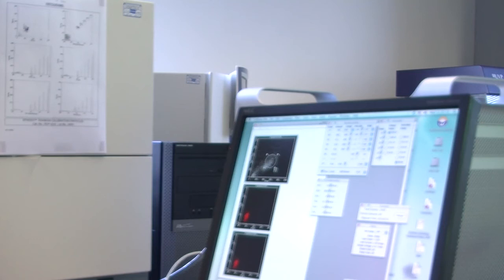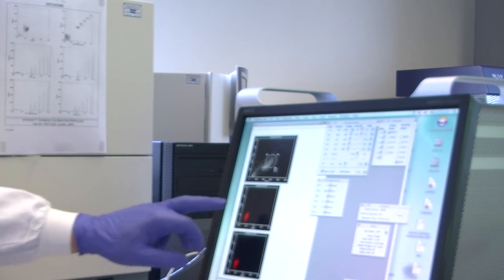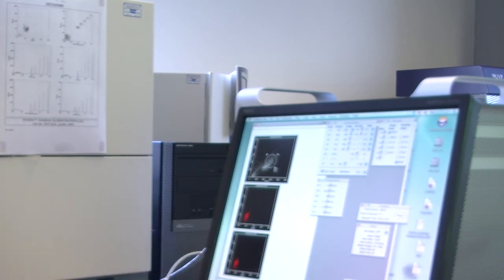So we need to acquire 10,000 of these, then we'll acquire 10,000 of the actual cell line. But this doesn't look to be significantly different to that first cell line. Now, not looking different doesn't mean it isn't different. There might be differences in the median fluorescences. So I'm always very cautious when I say there's no difference. It doesn't look much different, and that's only our visual assessment. But that's fine because it looks like these cells have about the same general stickiness.